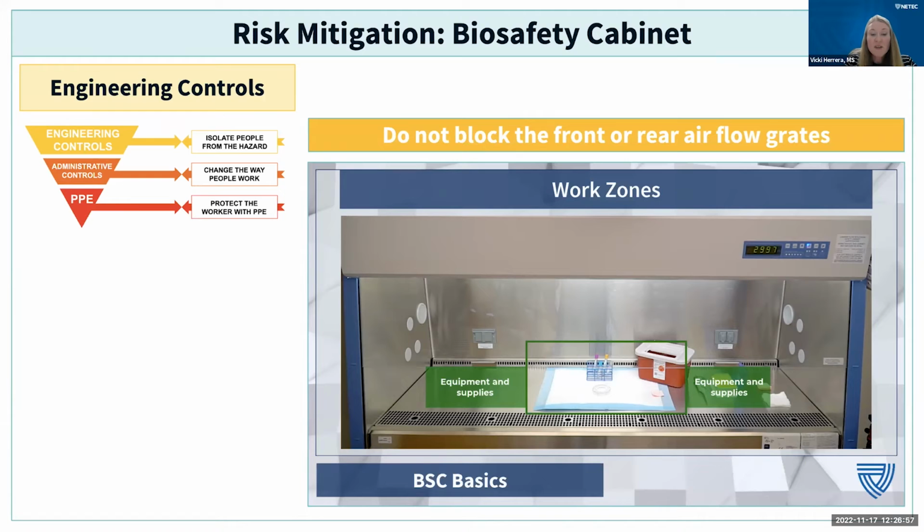NETEC also has a video that we'll link at the end that shows you how to work safely in the biosafety cabinets. But you want to make sure that you are minimizing the items that are inside the cabinet. You also want to make sure that you are not blocking the airflow vents. So this is going to limit you on the amount of instrumentation or other items that you can have inside the cabinet. You should also minimize your movements in order to maximize the efficiency of the cabinet.